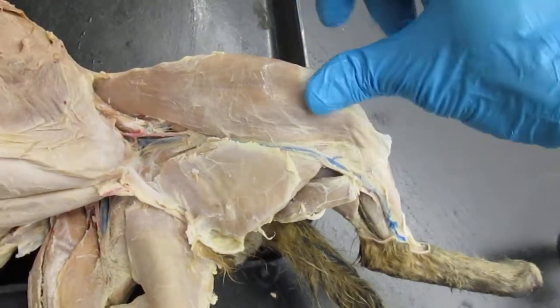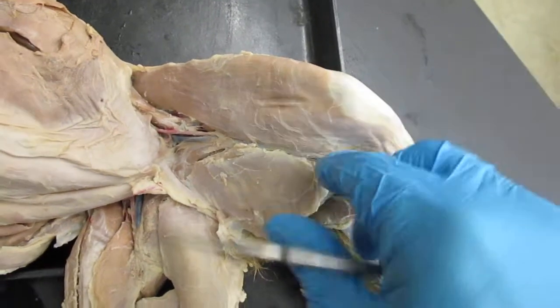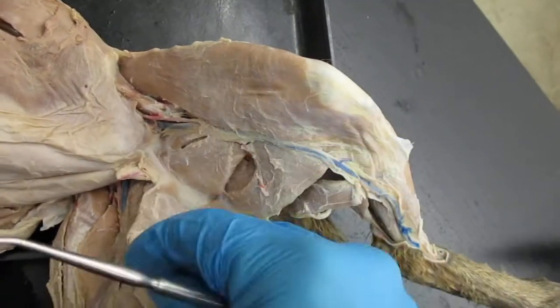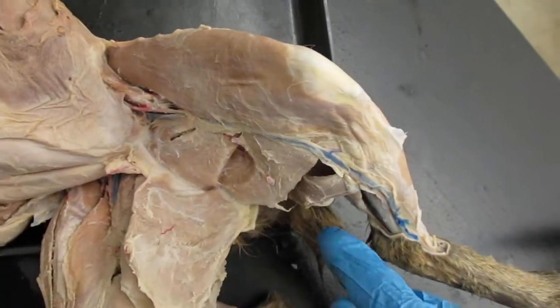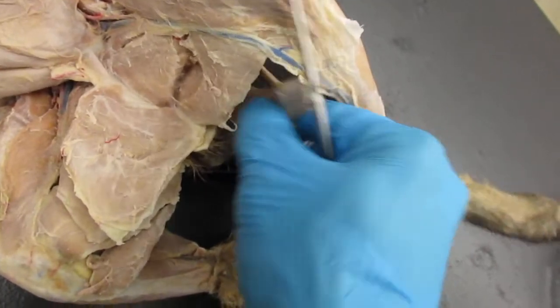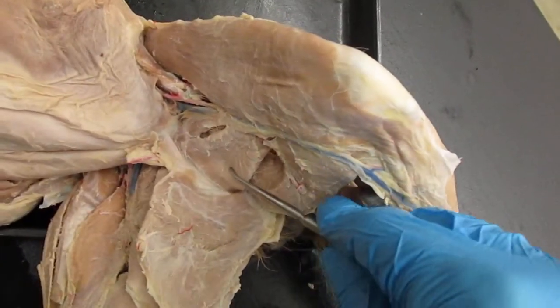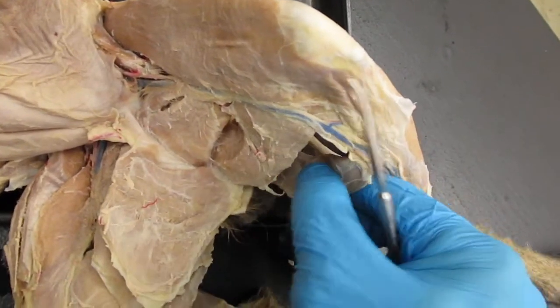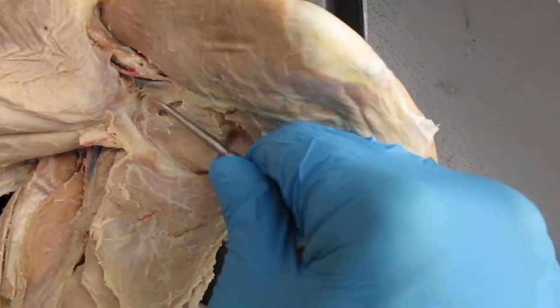So here's the sartorius muscle. Here's the gracilis muscle right here. The gracilis muscle is going to cover the hamstring group. So this is the semitendinosus, semimembranosus, and the adductors right here. Semitendinosus, semimembranosus, and then the adductors right in here.